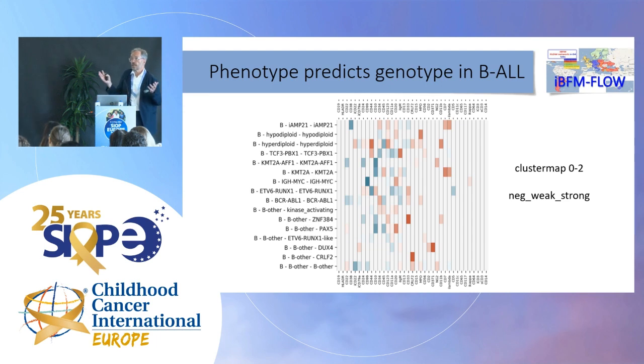So not all countries, not all laboratories, nations have everything there. You know, you do RNA-seq and this and that, and not all of us have that. So flow cytometry is really, on the day you get the sample, you can inform, please look for that, look for that.